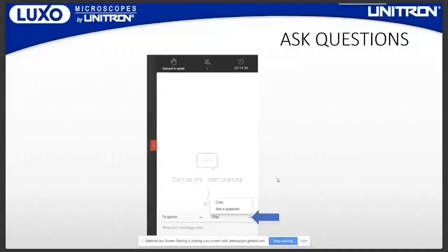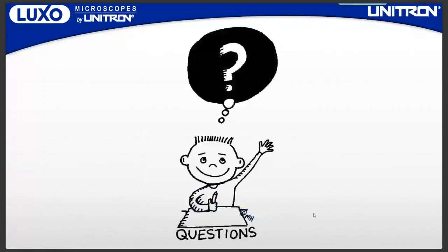Yep. Great. All right, well, we're about ready to enter the Q&A session of our webinar. So if you have any questions, please use the chat or the Q&A area to submit your question to us, and we'll take a look at that. So let me proceed to the Q&A. I have a couple of questions here that were submitted. One question is coming in through the chat. Kieran, how do you recommend that someone align their sample for comparison with the golden sample?